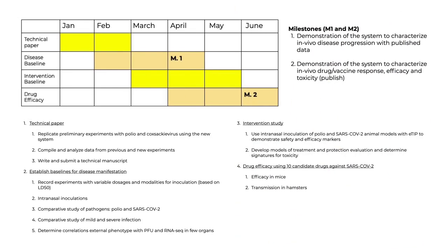In the next 6 months, we plan to A. Complete ongoing experiments and publish findings with our research collaborators, B. Develop several more cages based on demand from partner labs and test new sensors for specialized experiments. C. Ultimately, we plan to demonstrate how this type of data can be utilized for basic research, drug testing, as well as characterization of treatment response to optimize and shorten preclinical testing.